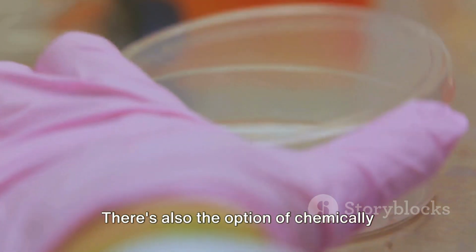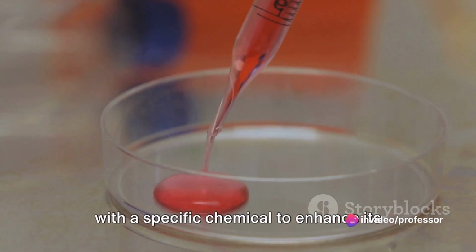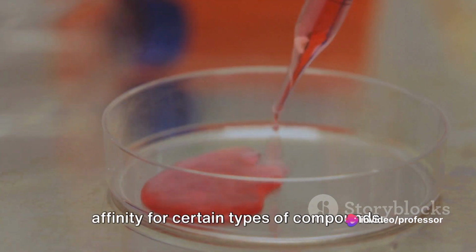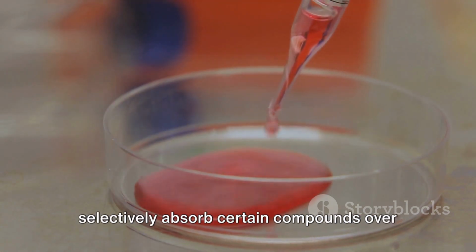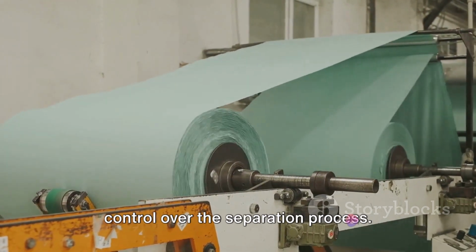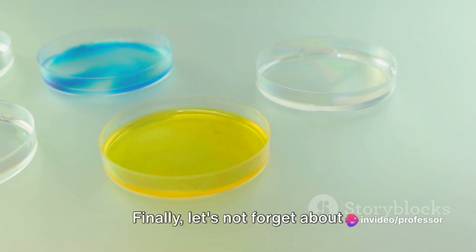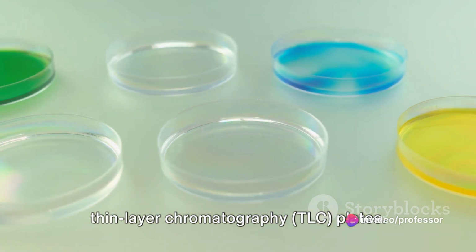There's also the option of chemically modified paper, where the paper is treated with a specific chemical to enhance its affinity for certain types of compounds. This modification allows the paper to selectively absorb certain compounds over others, providing a higher degree of control over the separation process. Finally, let's not forget about thin layer chromatography (TLC) plates.